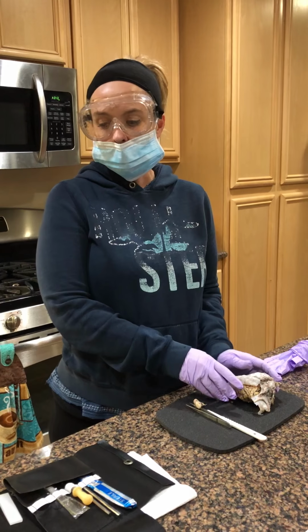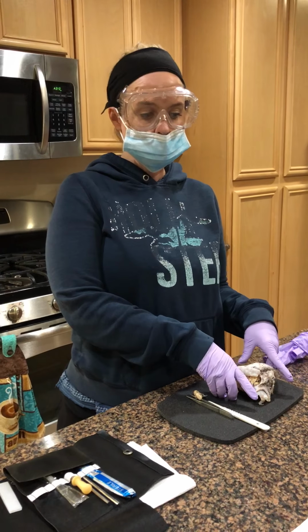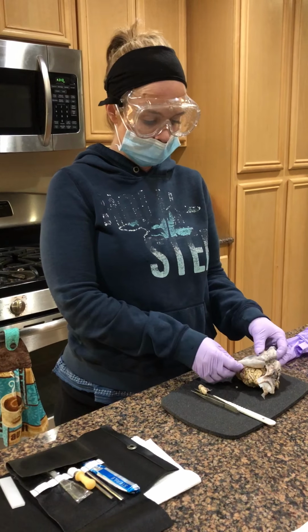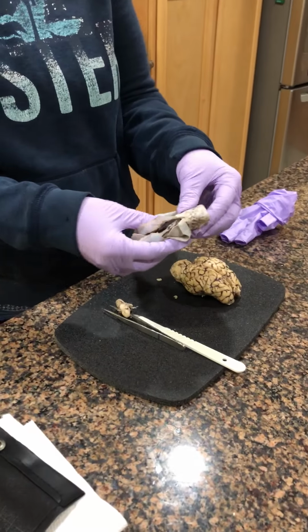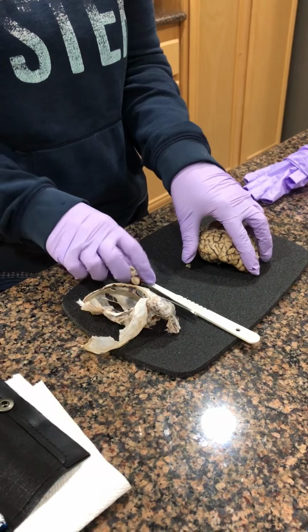Tamara Overby, and I'm going to be dissecting the sheep brain today. It's 2/23/18, and I started out washing the sheep's brain off, and I did pull the meninges off, which is this kind of white covering that was over it. So I'll go over the different areas first.